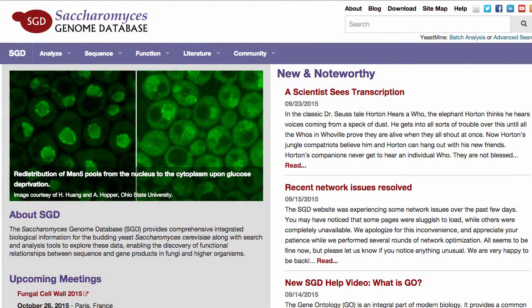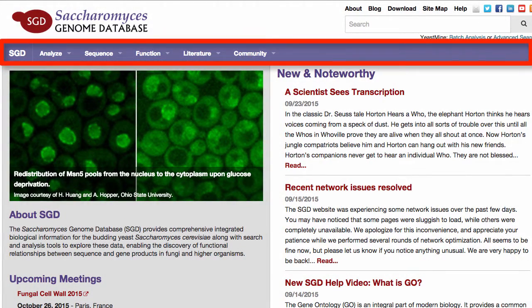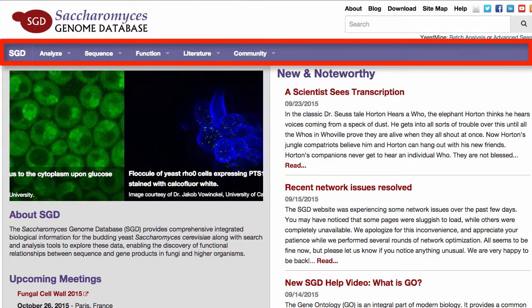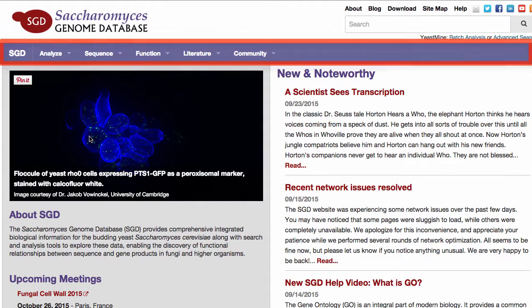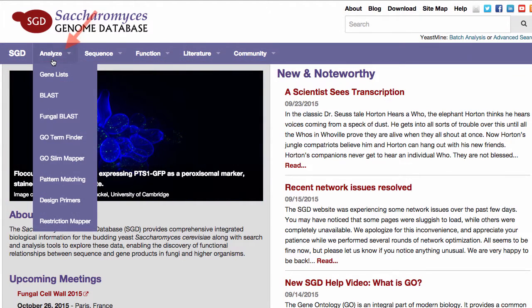You can find the GoSlim Mapping tool using the purple toolbar that runs across the top of most SGD webpages. Just mouse over the Analyze button, scroll down, and click on GoSlim Mapper.